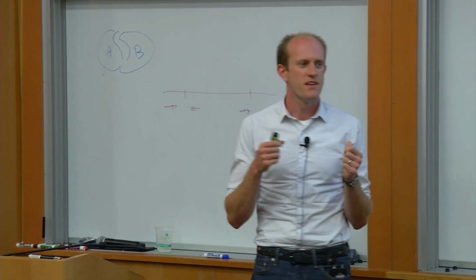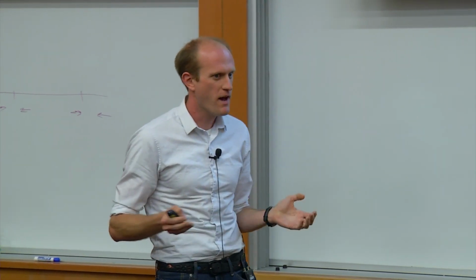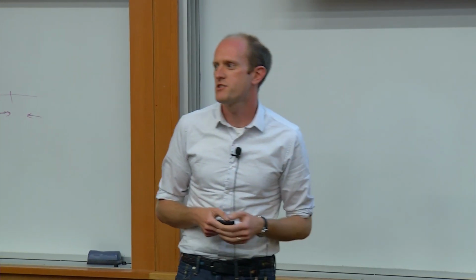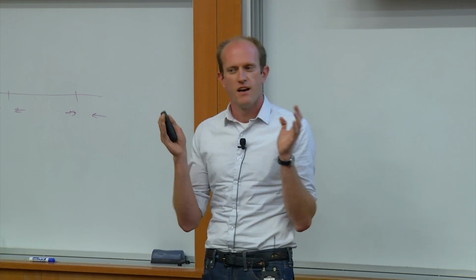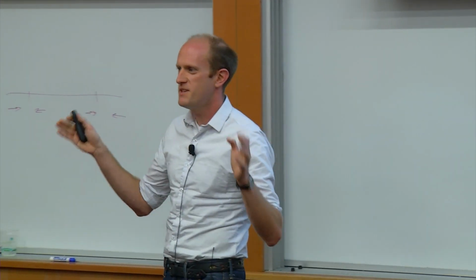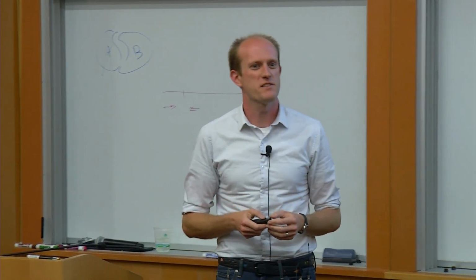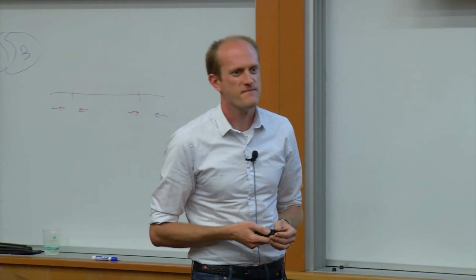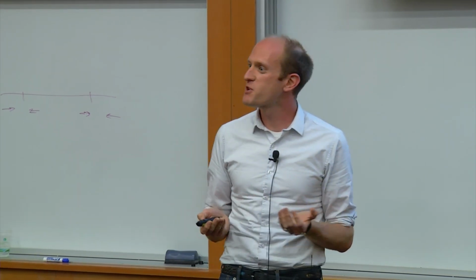Okay, this is a problem that has been solved before in bioinformatics, and you've heard a little bit about it in terms of other revolutions in biology. So let's say we have an entire genome, and we want to figure out where, I'll give you a hint, it's a short piece of DNA that you have read in an experiment. How do you figure out where that goes in a genome? What does this sound like? You've got a 20mer, or maybe it's a 150mer.